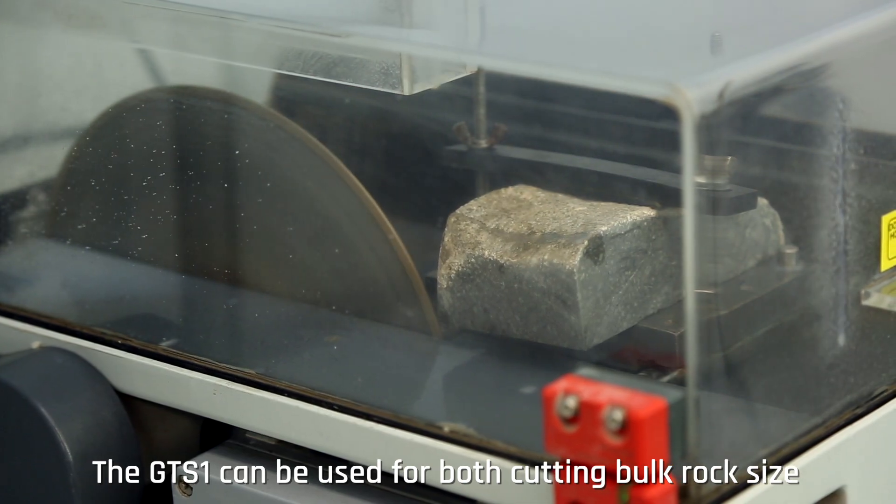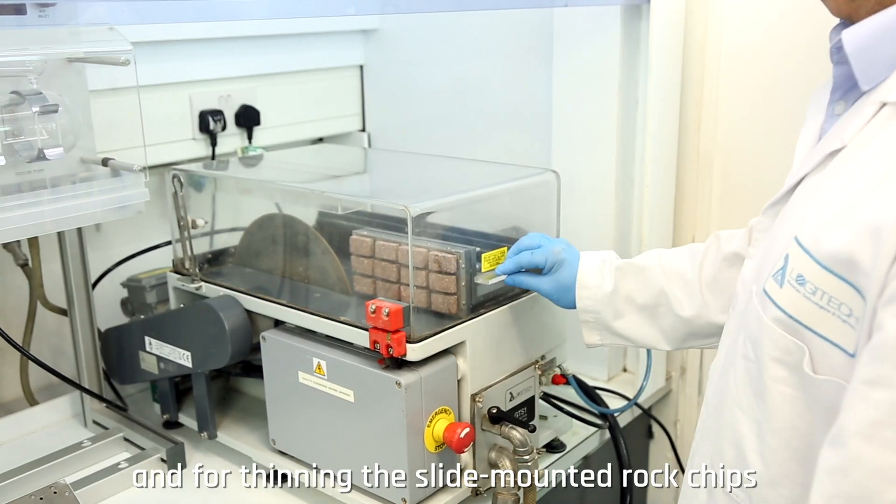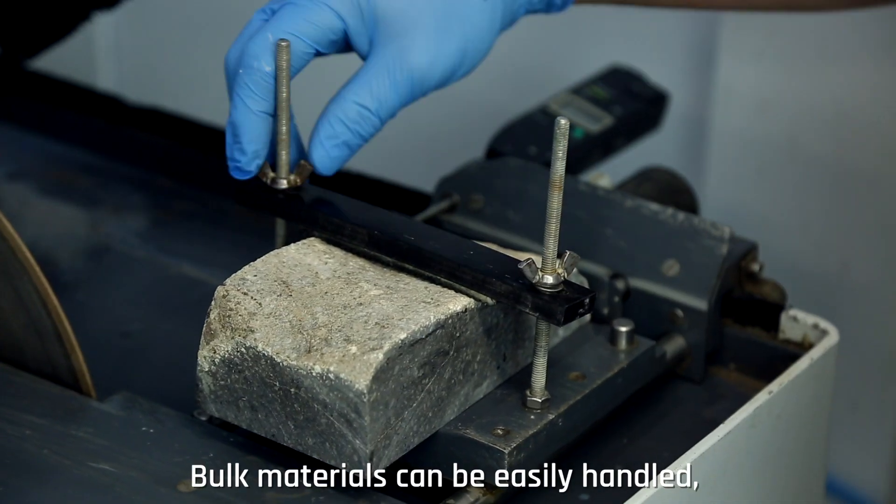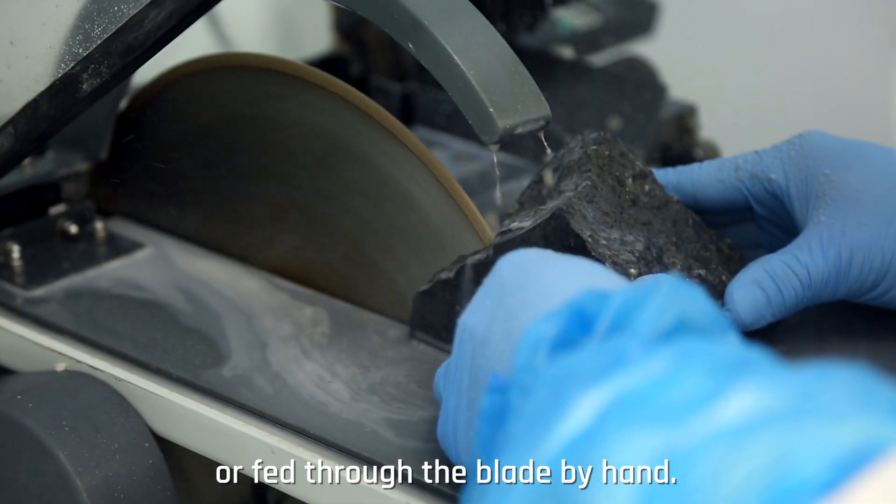The GTS-1 can be used for both cutting bulk rock size and for thinning the slide-mounted rock chips prior to final lapping. Bulk materials can be easily handled by mounting on the sample table or fed through the blade by hand.